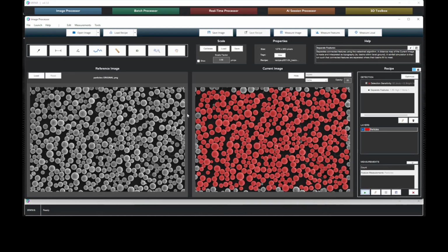This solution works as demonstrated on a single image or a batch of images. We recommend measuring a larger particle volume to improve curve fit accuracy and statistical power.